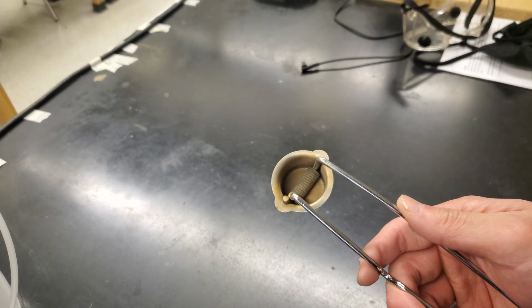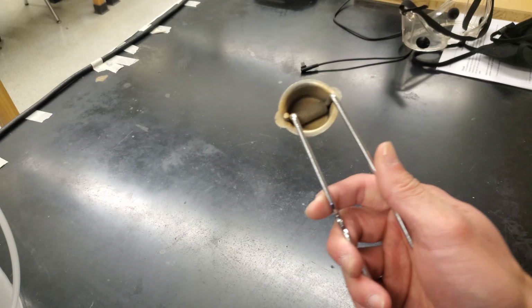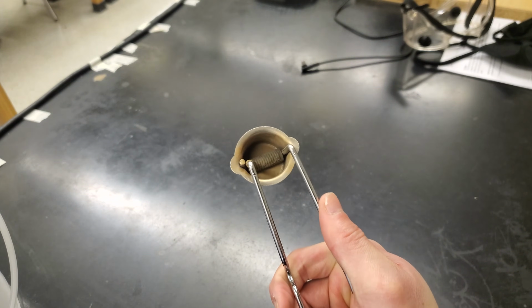Alrighty guys, so there's one important thing that I forgot to mention about using the strikers for the Bunsen burner, so let me go over it with you now. What you don't want to do is just go back and forth like this, because then you're not going to get a spark.